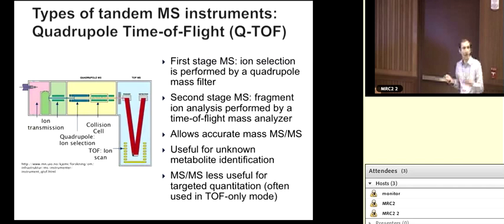So if you ever have to do this, what's the best instrument for mass spec or for metabolomics? I get asked that sometimes. Well, it really depends on what you're doing. Targeted metabolite analysis, you may want to start with the triple quad. For simplicity and accurate mass analysis, a TOF is hard to beat. If you need accurate mass and some MS-MS capability, a QTOF is good. Highest capability, but with highest cost, perhaps an LTQ Orbitrap. Each instrument has its own advantages, as I already described. So available resources and your assay requirements will decide this.